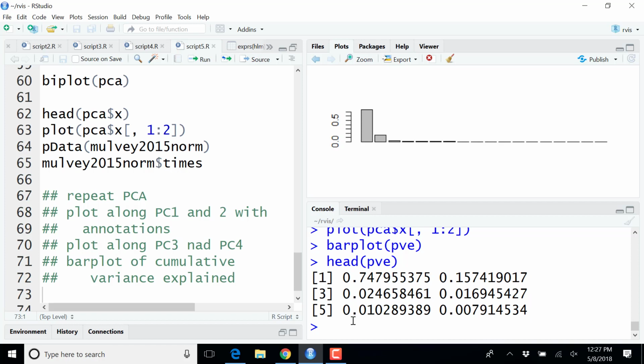Yes? How do you extract the principal components? So in PC1, 75% of the variation is explained. How do we know if that's 3 or 14 components? Can you extract that? You should be able to, right? I'm not sure I understand your question. So this is coming from a proteomic data set, right? And we're comparing different groups, and there's variation. And so I want to know what's causing that variation.